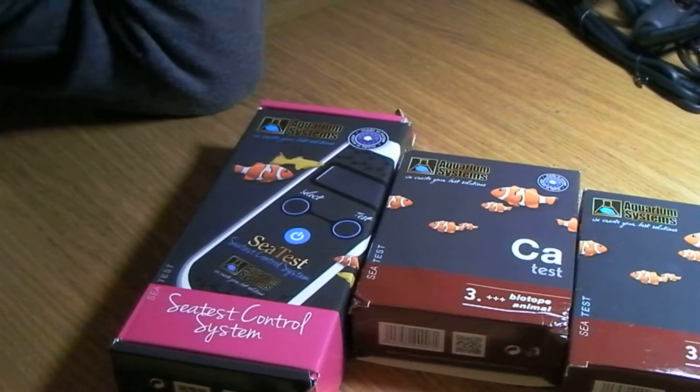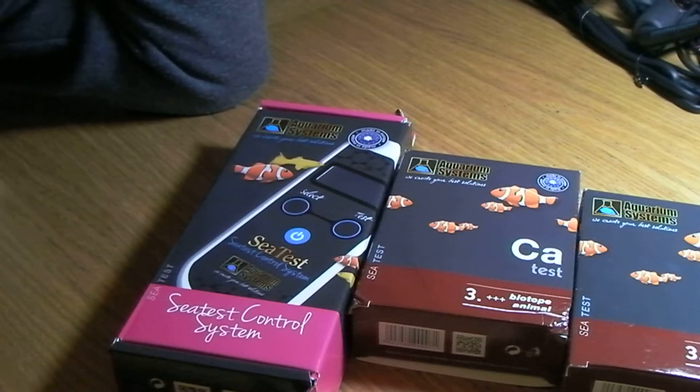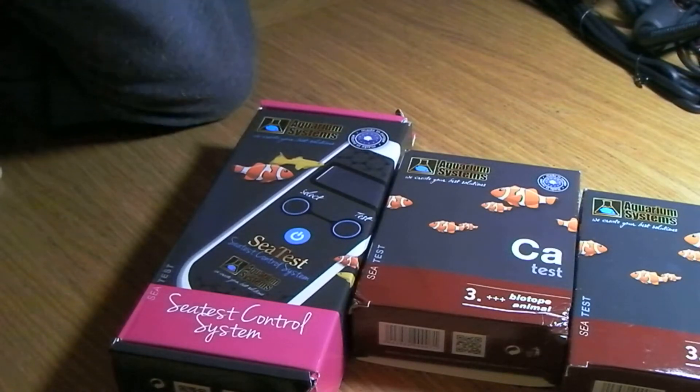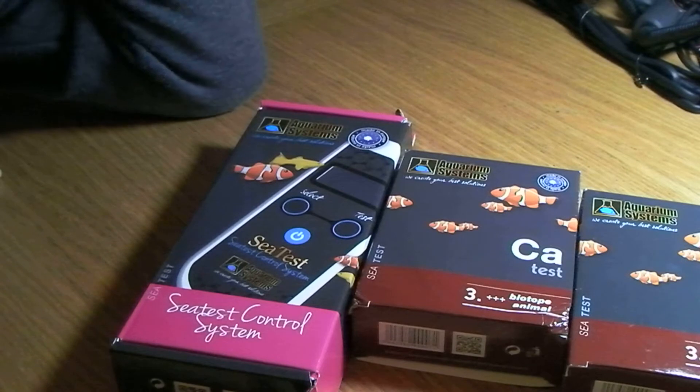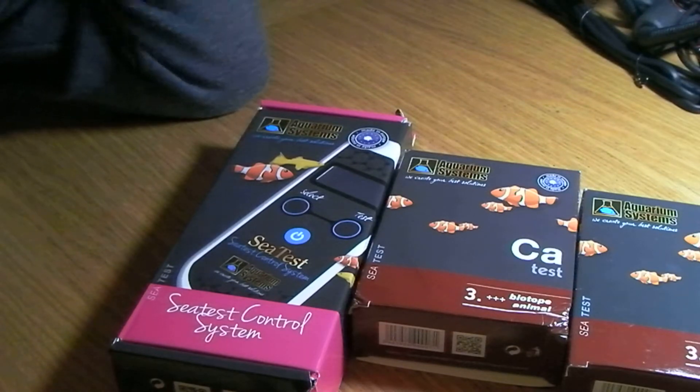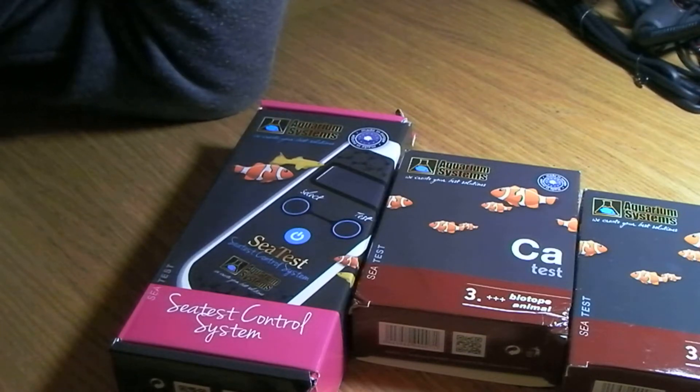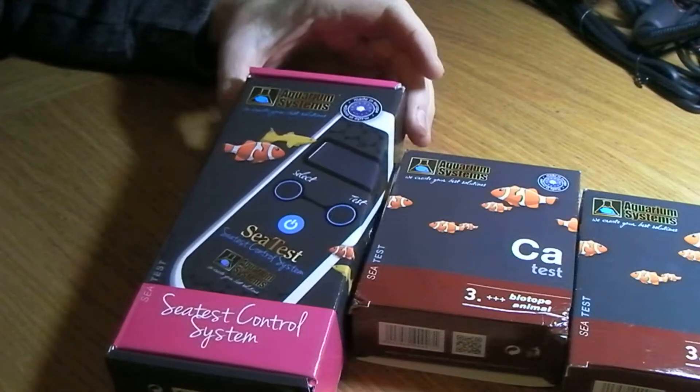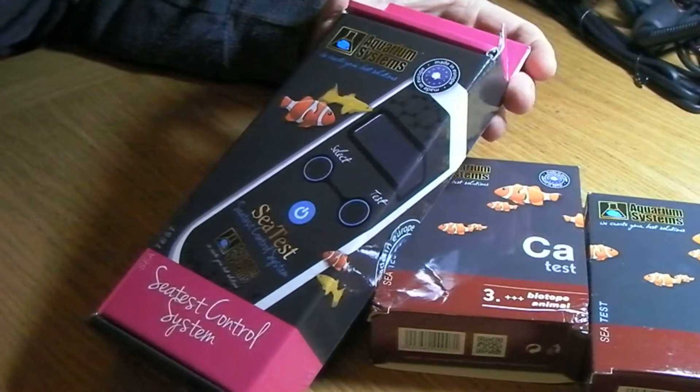Hi guys, some of you remember a few weeks ago, or possibly even longer than that now, I mentioned that I'm slightly colorblind and some of the water testing kits, the colors I just really struggled to see accurately compared to somebody with normal color vision. I mentioned that in my searching for another solution, I came across a device that gave you an LCD readout. Well, as soon as I actually wanted to go and find it again I couldn't, but fortunately about a week ago I came across the product again.